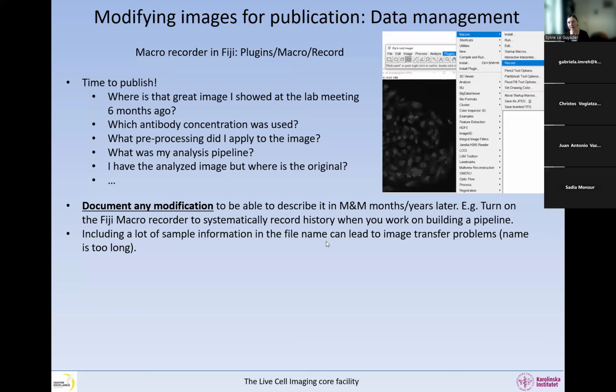This is the great advantage of Omero. In Omero, you can modify the metadata and add data there. You can add lots of different things to each image, like the concentration of the antibody or whatever, and you can do this in batch. So today I've imaged with that concentration, and all these images have the same. You can do this all at once. So Omero is a very nice data management tool in that sense.